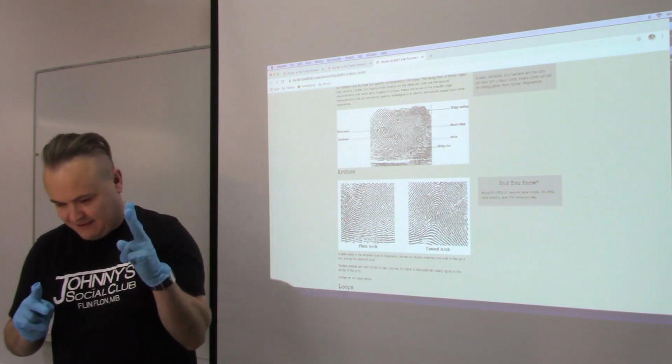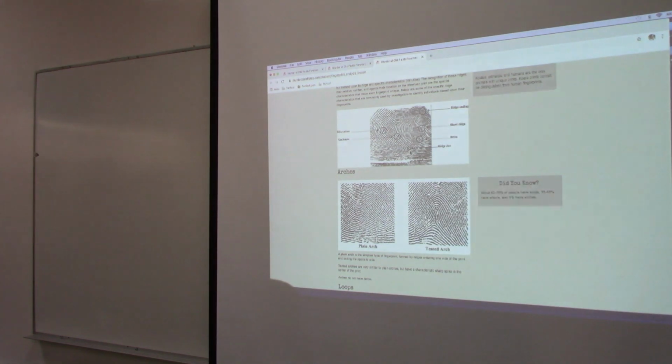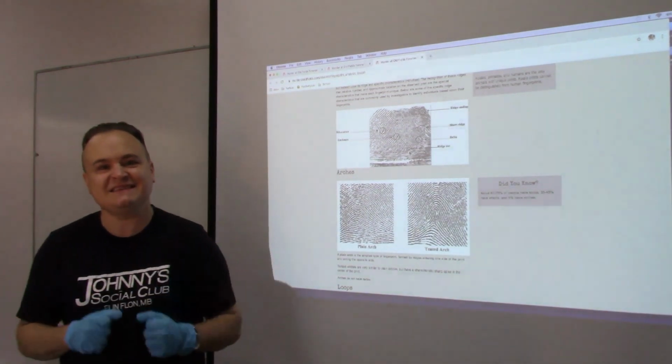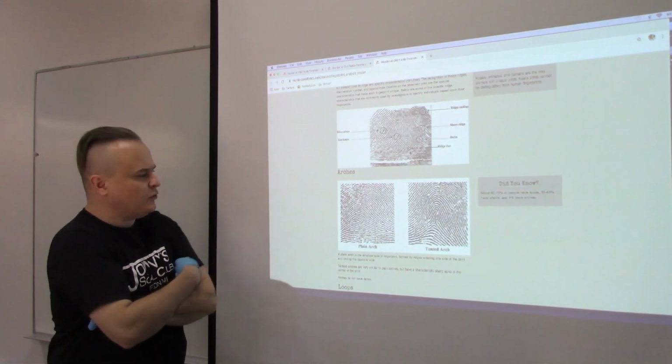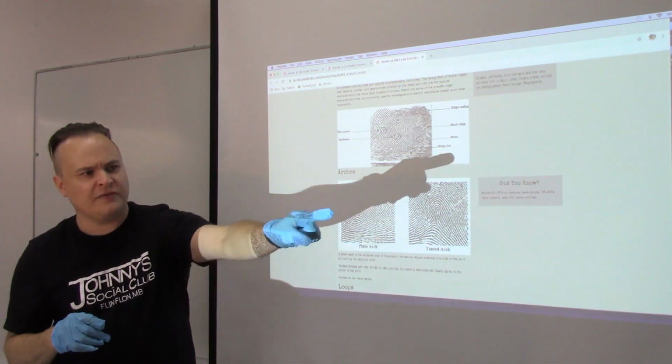The second thing, let me just grab a disc here. Perfect. The second thing is called dusting for prints. What does that mean? That means, say you were walking around a crime scene, you say, oh, that looks like somebody left a fingerprint on that object, or on that glass, or on that window.